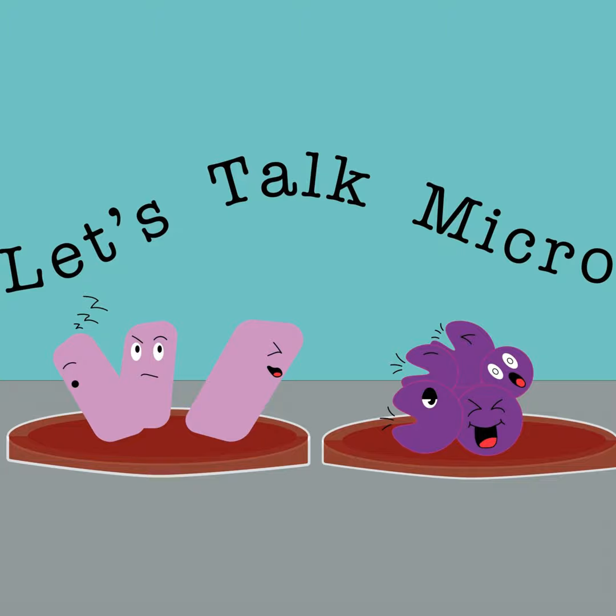Yes, definitely. So the validation process included a lot of different factors. It included evaluating different extraction protocols, and what kind of quality DNA you need for your actual process. It included looking at all the different library kits that Nanopore provides. They have different flow cell types as well that have different capabilities as far as data produced. We had to find out how many different samples we're going to multiplex, and then of course how long we're going to sequence for. So we evaluated all these different factors.